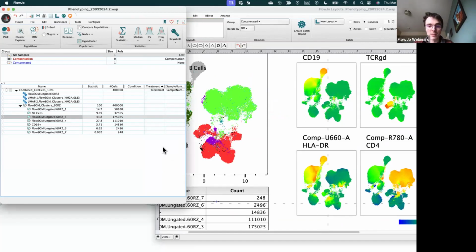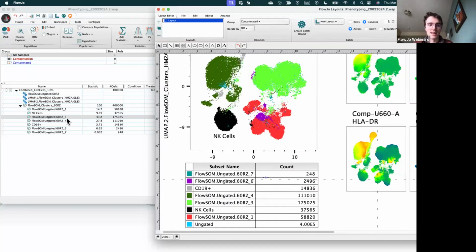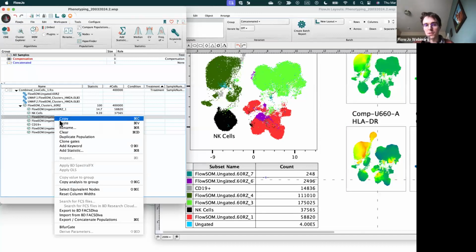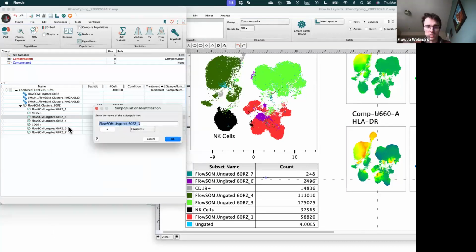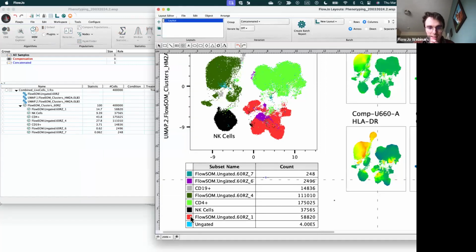Now, this is a T cell panel, so obviously within those T cell populations I'm going to have a lot of different subsets, and we can cluster these further to get maybe the different activation states. So let me call this CD4, and let me call the bottom one CD8. Sorry, I'm going to have to change the color again so I can understand what this is.